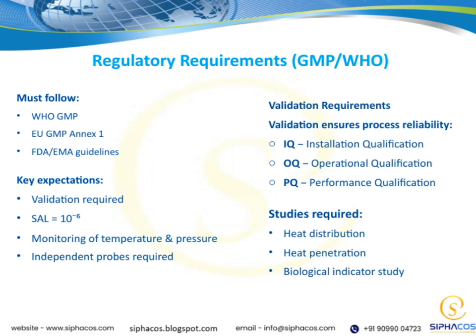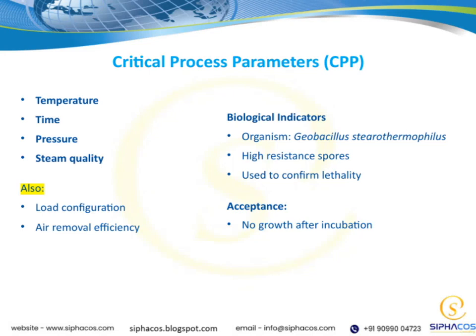safety of our products. Let's talk about biological indicators, which are a crucial part of ensuring sterilization effectiveness. The organism we typically use is Geobacillus stearothermophilus.